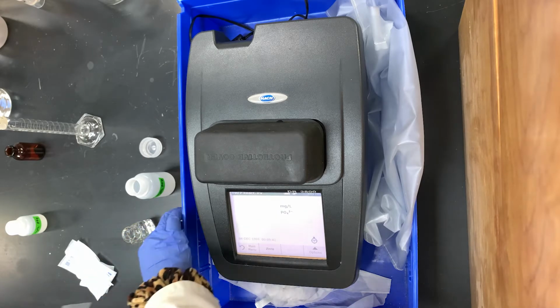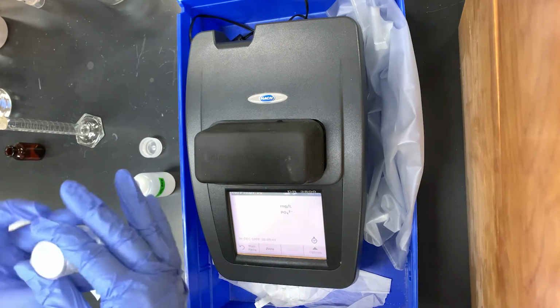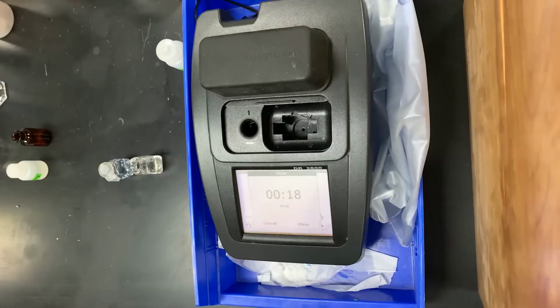This method is available online. If anyone is interested to read through the whole method, you can look up orthophosphate reactive Hach, and it should show up as a PDF. We will give this a good shake for about 30 seconds. This method does have a 2-minute reaction time after you shake it, and you can press the little timer symbol on the Hach to start this.